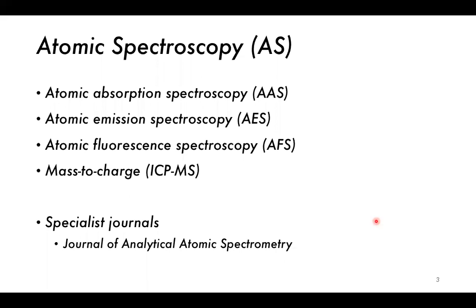So what we have here is the three or four major types. They're all basically doing similar things. They're taking our sample, and what they're doing with that sample is that they are combusting it in some way. Now, the differences are either what they are detecting after combustion is complete or how they are combusting. So the first three here are pretty similar in terms of the internal workings of the machine. They're the traditional forms. What they are measuring, though, is different.